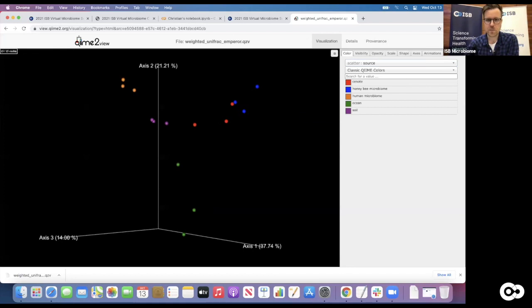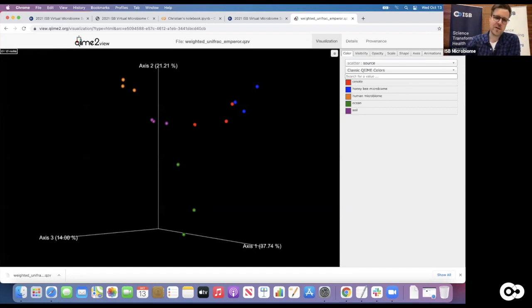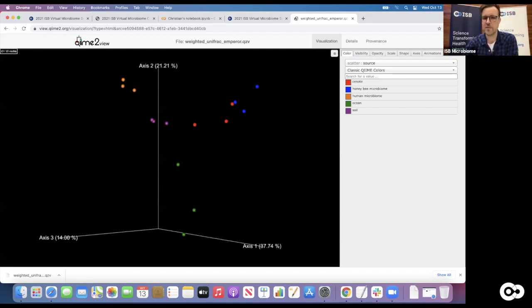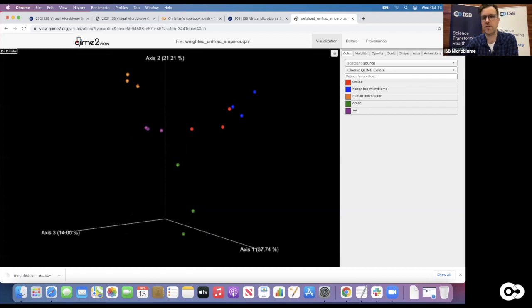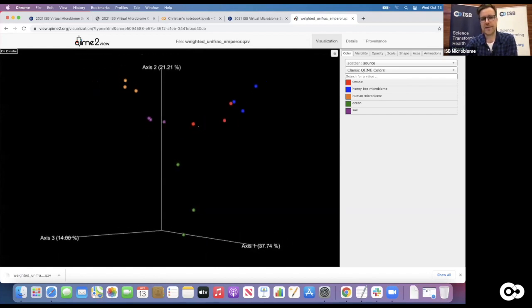We have three clusters that are somewhat close to each other: the cenotes (sinkholes in Yucatan), the soil, and that kind of makes sense - cenotes are embedded in an environment that's not exactly soil since it's fresh water, but it's surrounded by a lot of soil with plants and a lot of life. You wouldn't be surprised that it's somewhat embedded between ocean and soil samples. We also see the honeybee microbiome, which is actually closer to the sinkholes than to the human gut microbiome.